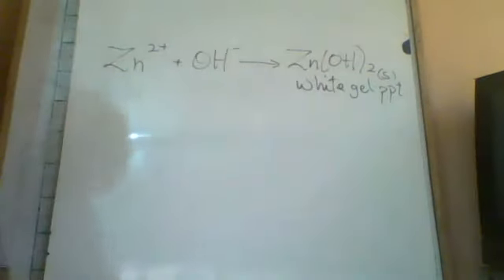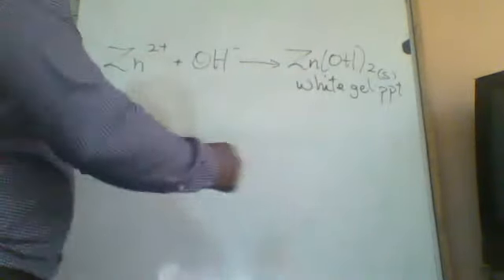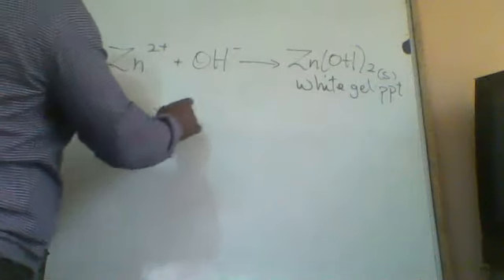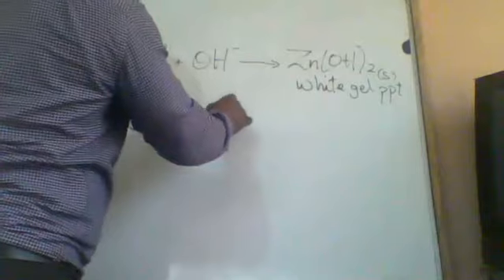This is a solid, and this gives you the white gelatinous PPT. Now we don't add in excess. Then the PPT which has been formed is heated strongly.